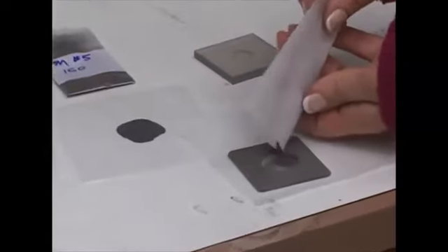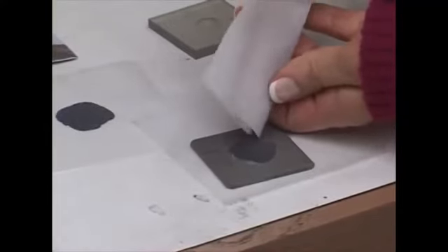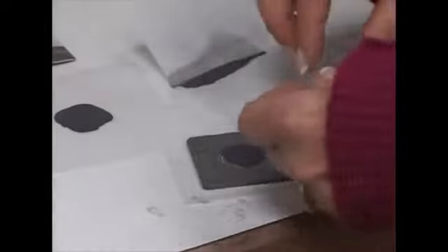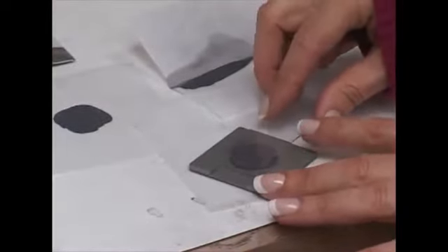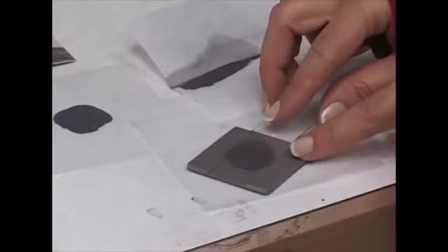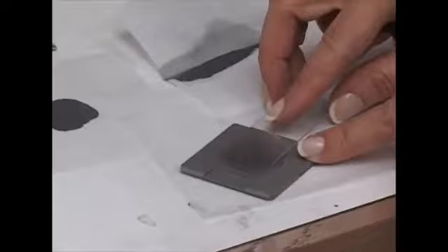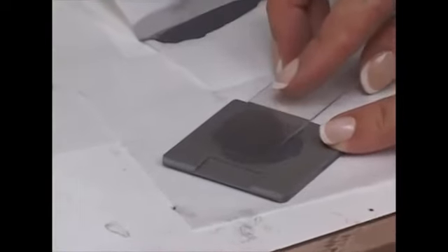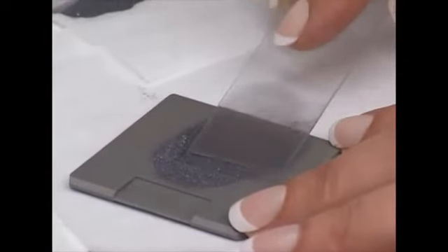Place your sample in the well and just kind of estimate how much you're going to need. You're going to be pressing it down. You want to make sure that it's filling the well, but it's still flat with the surface of the sample holder. And you just gently scrape off whatever comes out of the well.